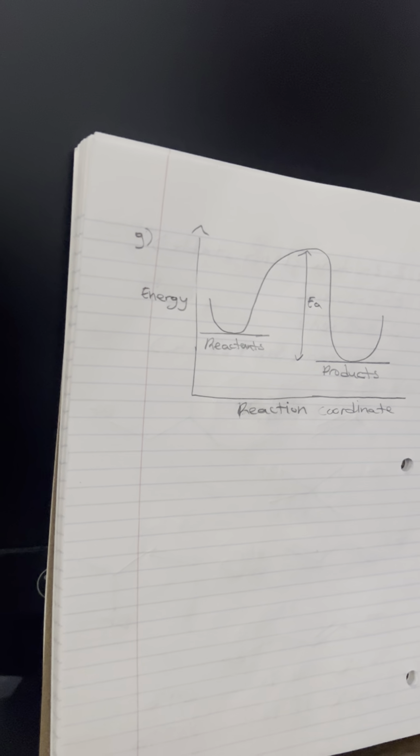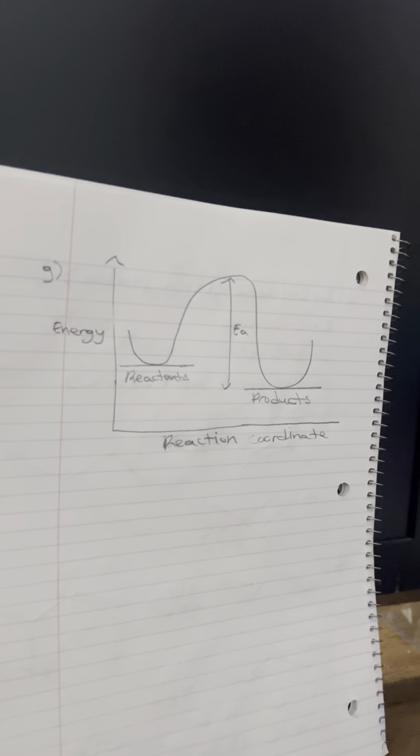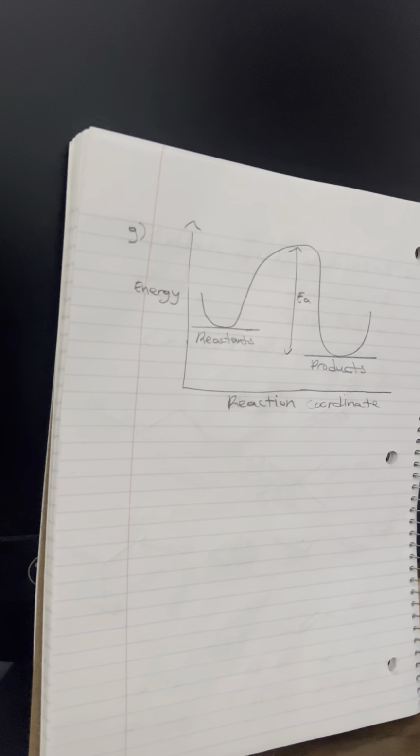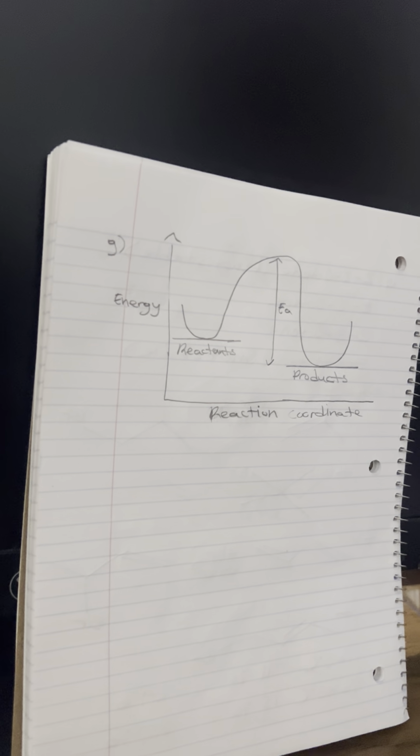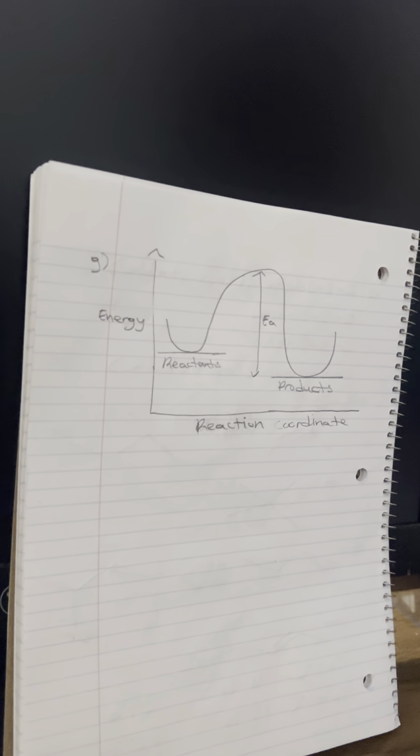In the product, the C=C stretch and C-H bending peaks will be absent, indicating the loss of the double bond. A new C-Br stretch may appear around 500 to 700 cm^-1, though it's often weaker and may not always be easily observed in the IR.